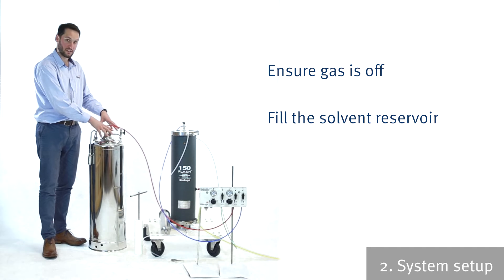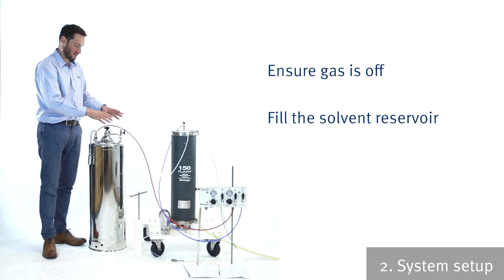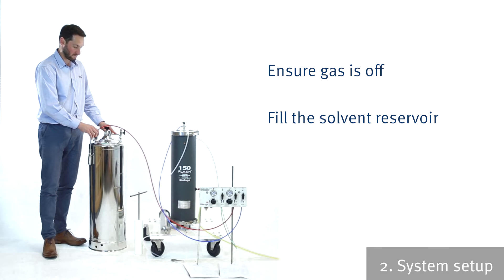This only needs to be done up finger tight. Once this is pressurized, the way that lid works, the pressure of the gas is pushing the seal up. So there's no need to do that up too tight.